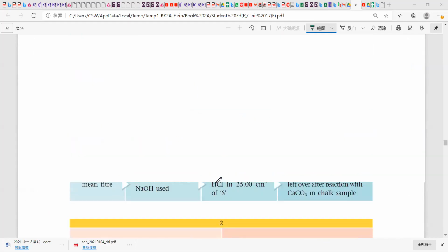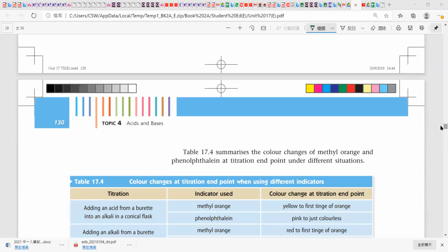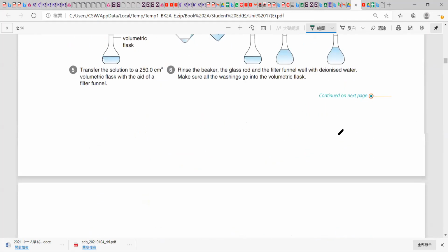Now, today we would continue. We start to do some calculation work, but before that we would get mixed with the lab procedure. So briefly, the concepts of the lab procedure should also be noted down. I would like to tell you something more about the procedures of doing this experiment. So we call it titration. Okay, we call it titration.